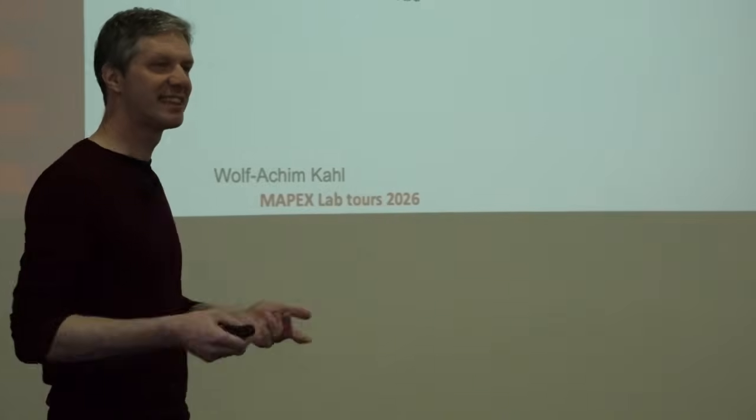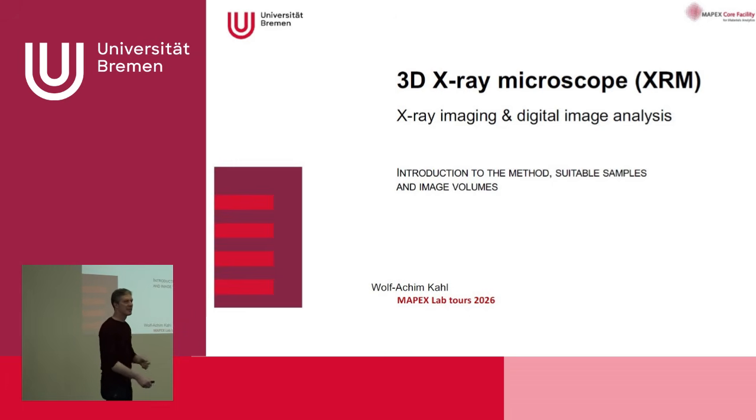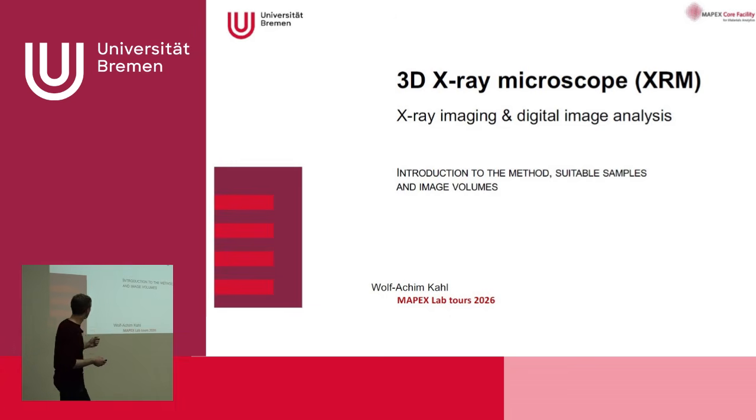I'm very glad and thankful that you are here for my introduction to this technique, the 3D X-ray microscope. Standing here, it's a difficult task because I have to give two talks: to present the device, the X-ray microscope itself, and then to tell you something about digital image analysis, because that's what our results are. When we do measurements with a 3D X-ray microscope, we measure a 3-dimensional image, and then we investigate this image. And this is what I'm going to tell you about.